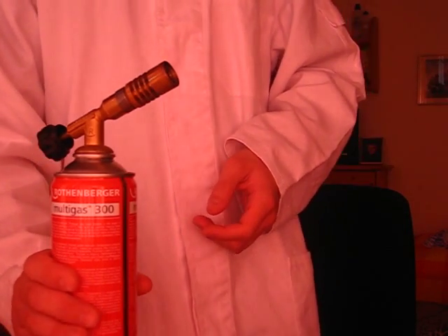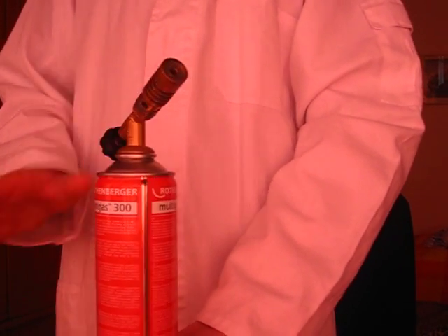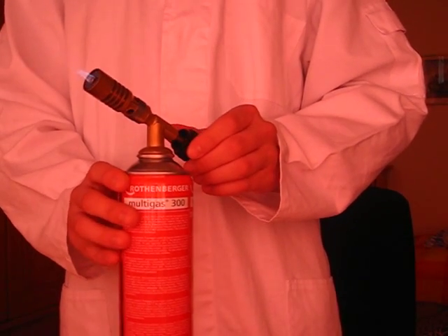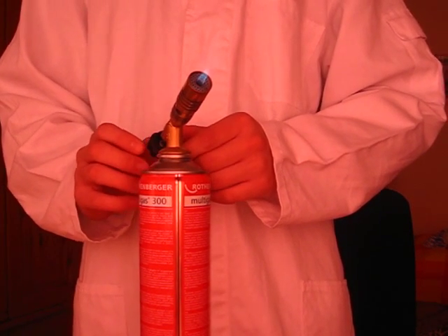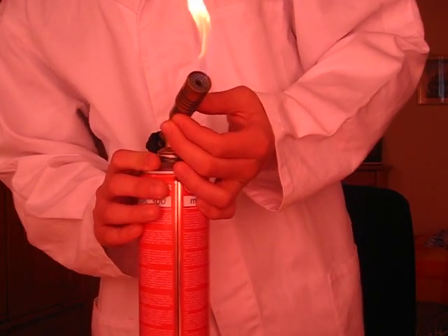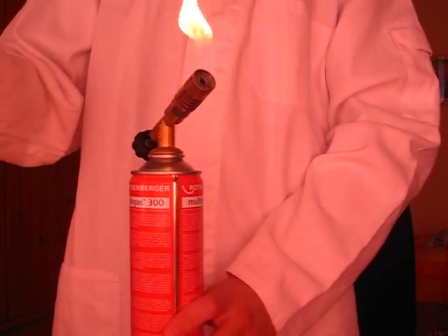We know that we work mostly with this flame here. This flame is just the most useful flame in the Bunsen burner, the flame that you use if you heat things and so on. But let me show you first what happens when we heat the test tube, which is just a very normal test tube, with this flame here.